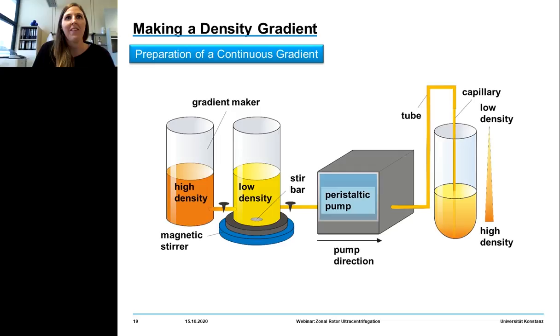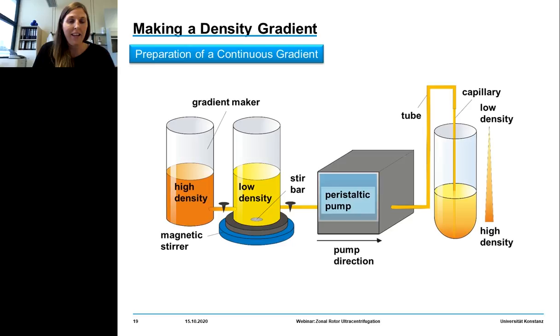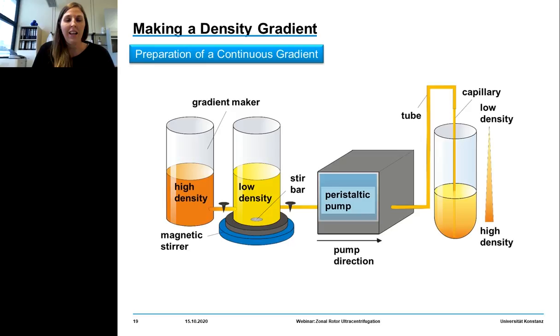A few experimental insights: it's really important that there are no air bubbles in the connection tube. For this, we first fill the mixing chamber with the low-density solution, open the tap, let the solution flow to the end of the channel, close the tap again, then fill in the high-density solution. It's also important that stir bars are in both chambers — this ensures the same fluid height. Regulate the power of the stir bar to avoid air bubbles and early cutoff of flow to the peristaltic pump.